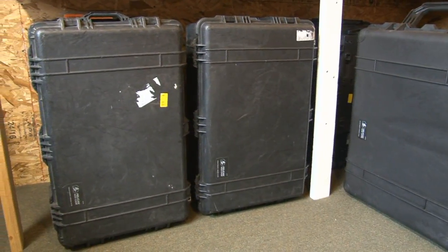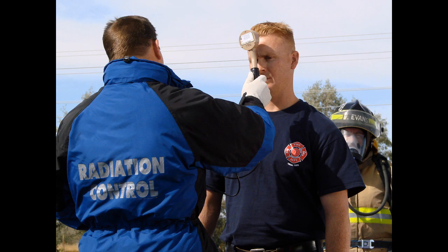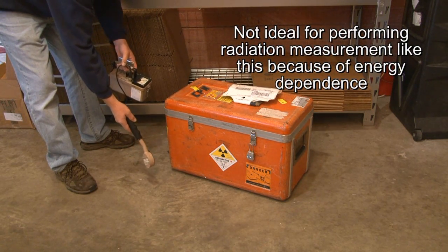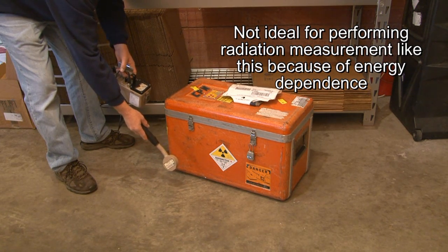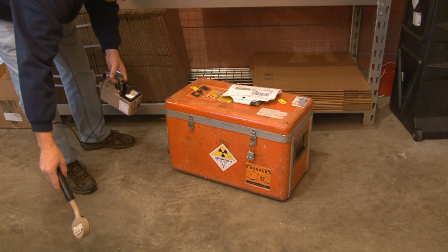This detector is a really good choice for surveying personnel and equipment for radioactive contamination. But as any health physicist will tell you, it's not such a great choice for taking radiation measurements. This detector's response to gamma radiation will vary significantly depending on the energy of the incoming gamma ray, meaning you're very likely to get false exposure or dose rate readings.